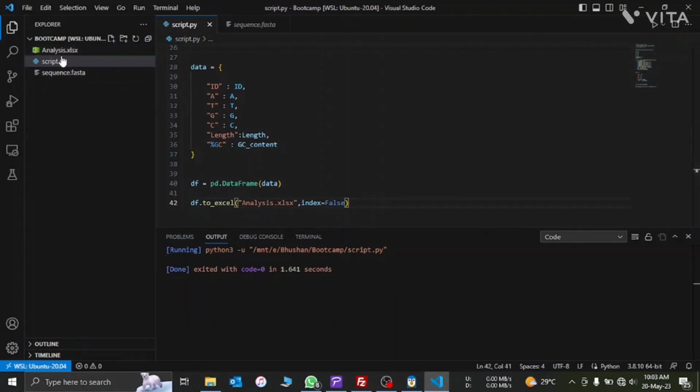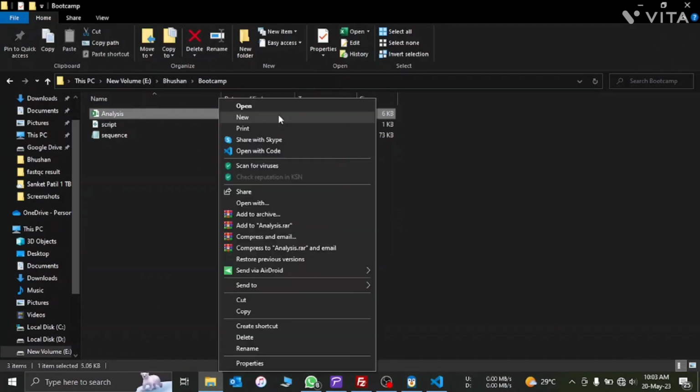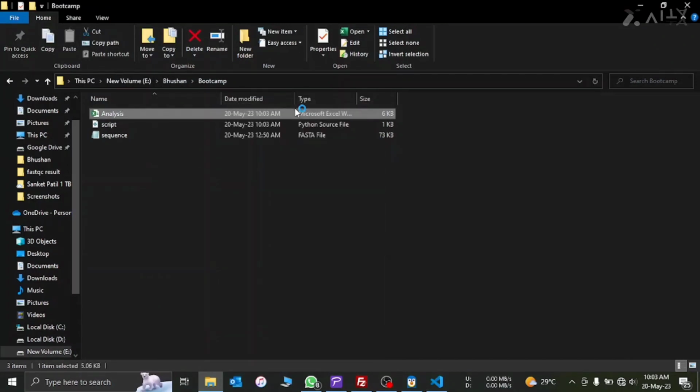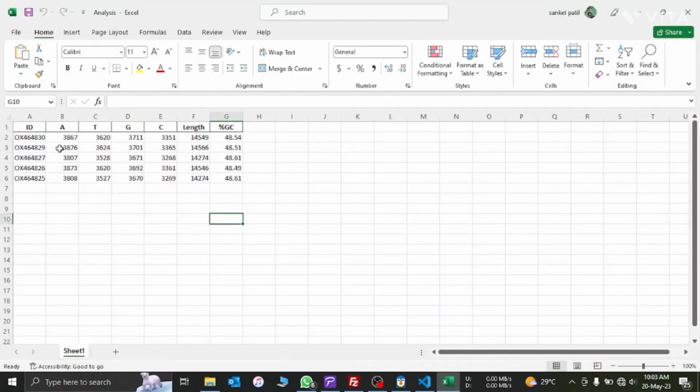The program has run completely. The analysis.xlsx file has been created. Let's see. I will open it. Yeah. That's it.